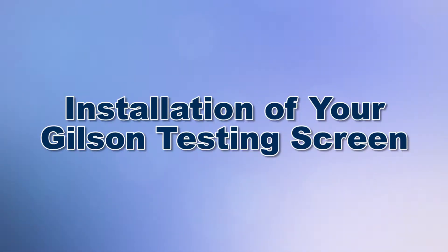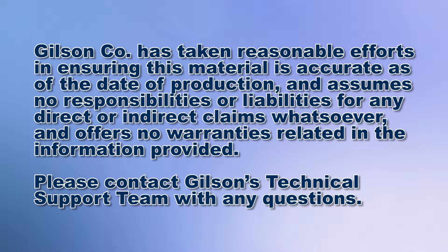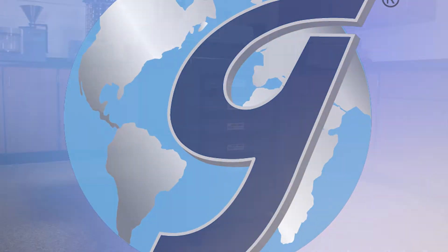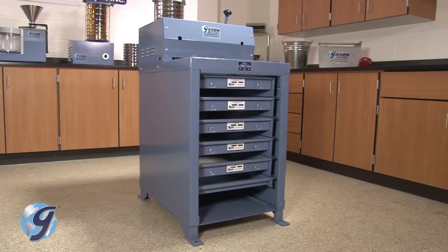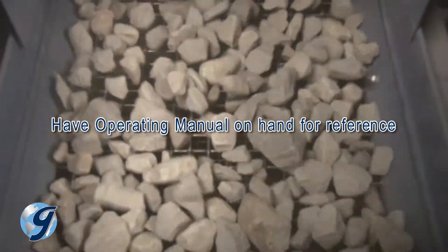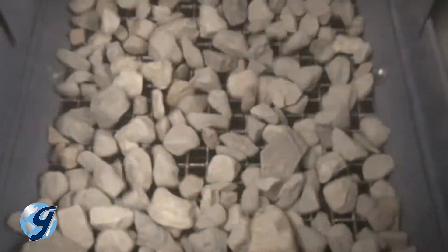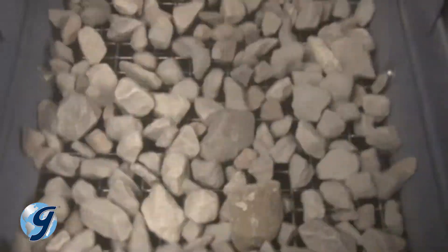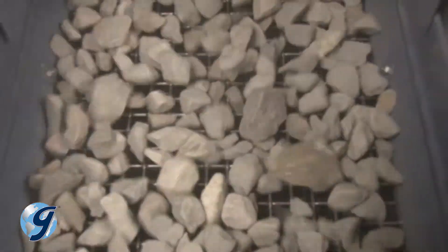Today we're going to specify the steps to installing your Gilson testing screen in your materials testing lab. The Gilson testing screens are rugged, tough machines that will provide years of service if installed and maintained correctly. During vibration, an improperly installed testing screen can travel across the lab floor, cause excessive vibration, decrease screening efficiency, and pose a safety risk to lab personnel.